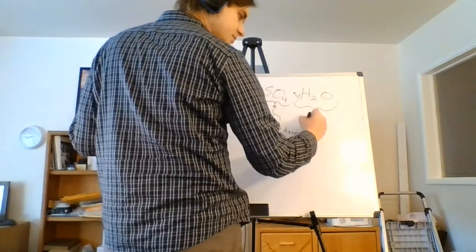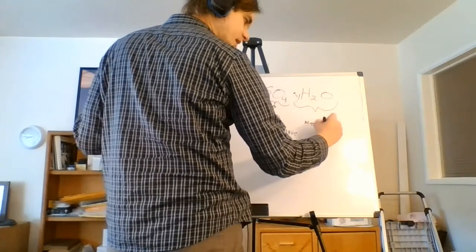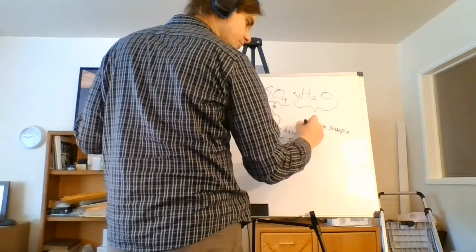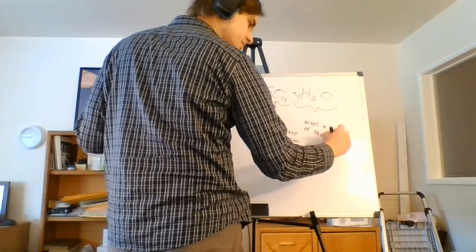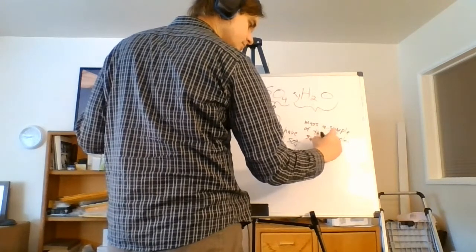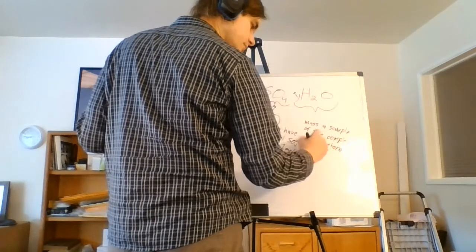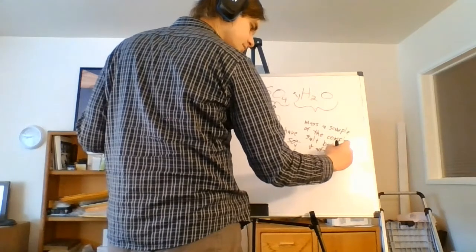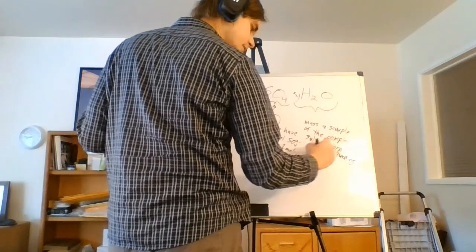We just mass a sample of the complex salt before and after heating it.